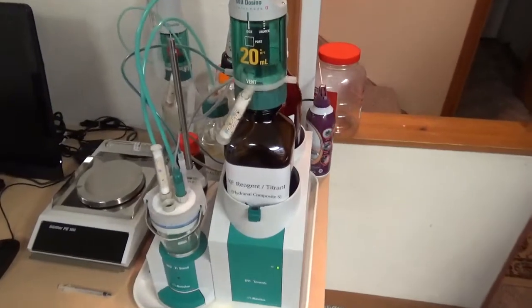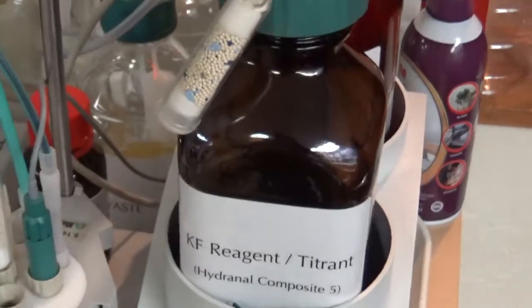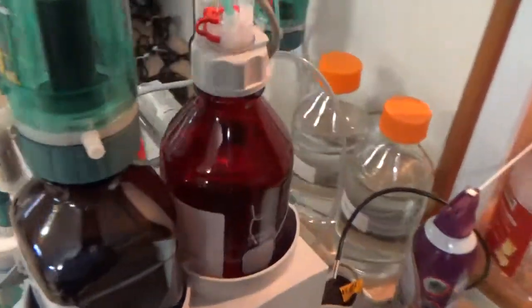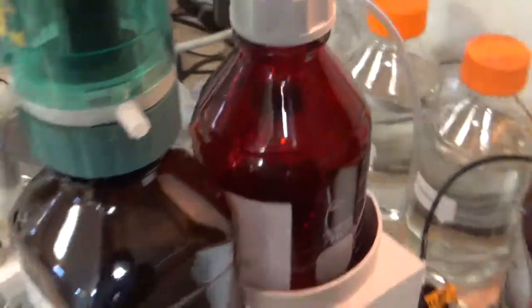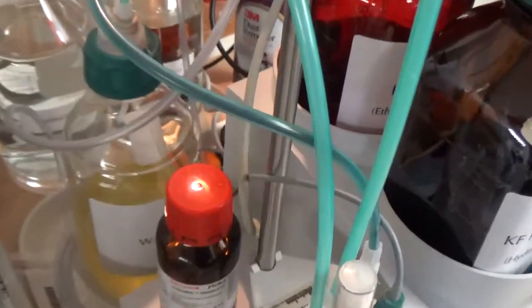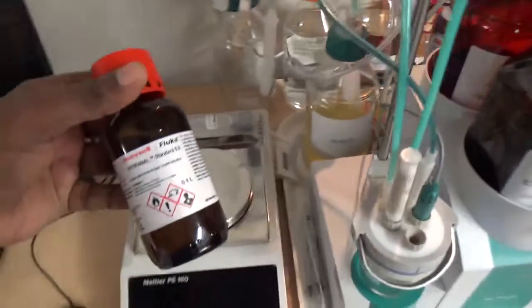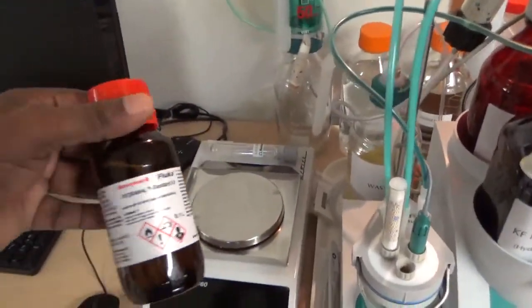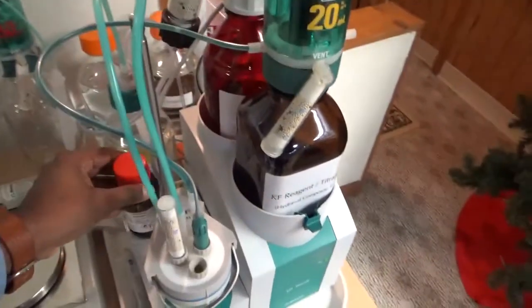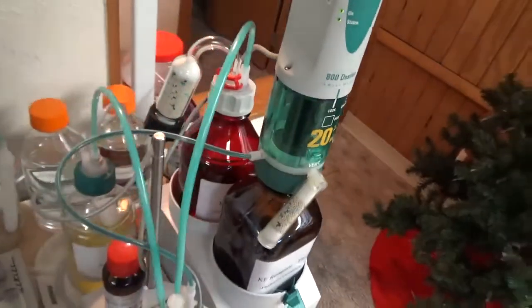We use a water standard with 5 ppm water — we run the standard first to calibrate the Karl Fischer equipment, then do the titration. The Karl Fischer titration with the 841 Titrando uses Tiamo software. When we do potentiometric titration for chloride or acid-base titration, we use Metrohm T-Base software where data is collected. These instruments are independent enough to generate the titration plot, and once titration is done, the result is automatically transferred to T-Base software.